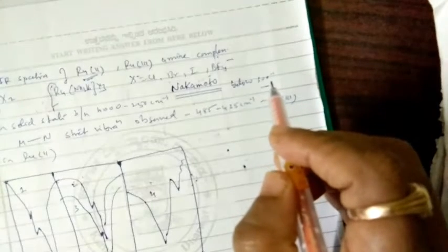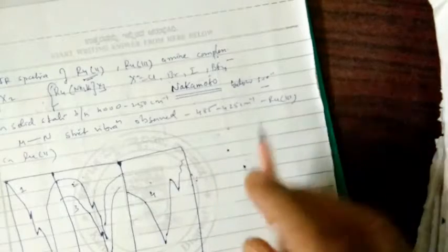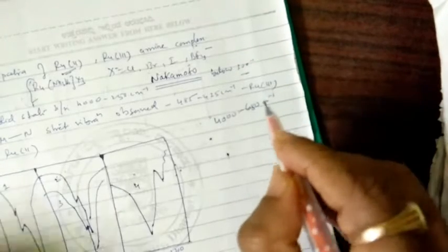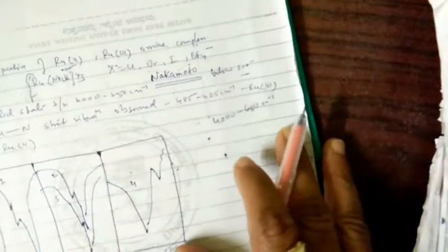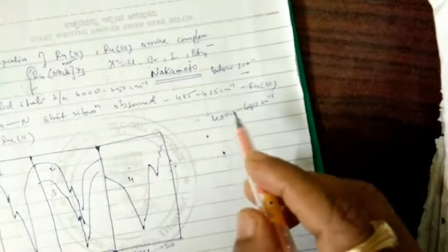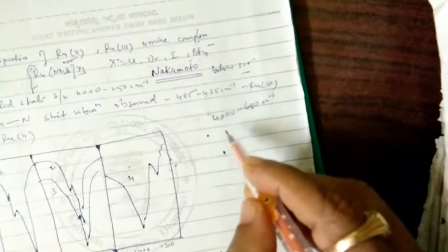For these complexes you can see the band assignment between 4000 and 650 per centimeter, and the NH stretching vibrations were very easily resolvable, the NH stretching frequency here.